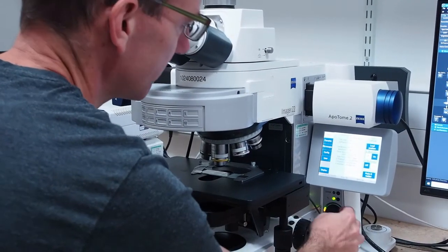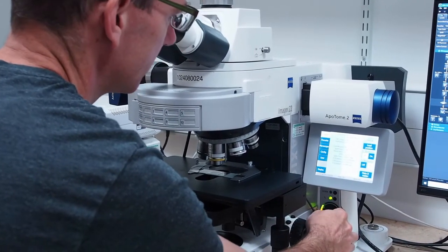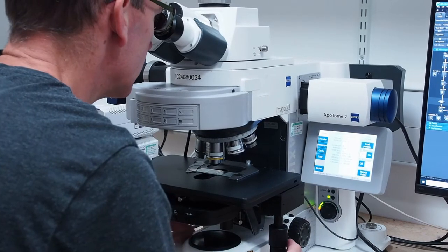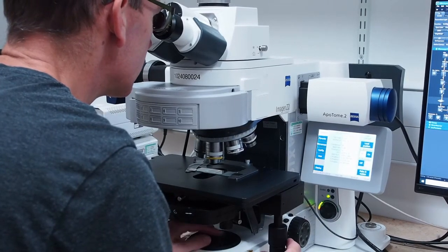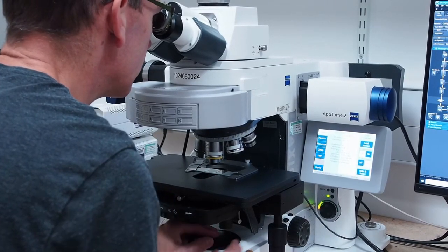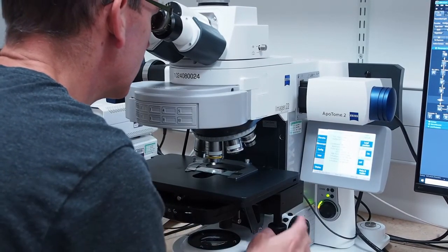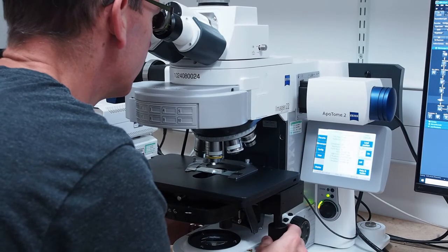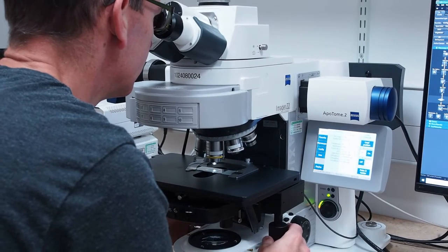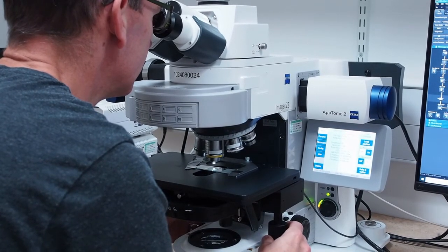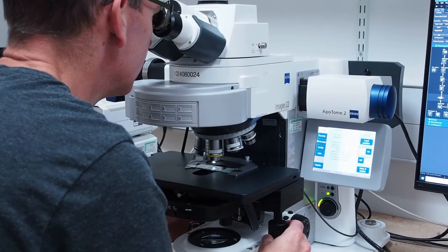Focus your sample using the focus knob on either side of the microscope and adjust the lamp intensity if necessary using the knob on the right. Don't forget to remove the anti-reflection disc from the transmission light path underneath the condenser.